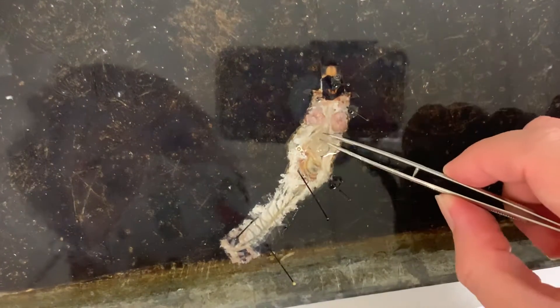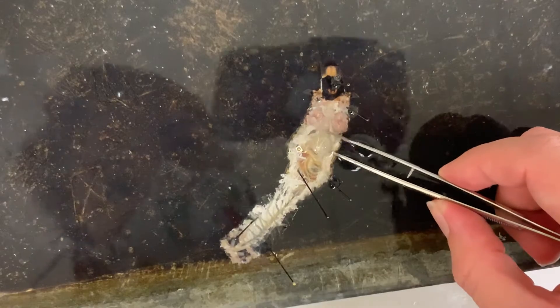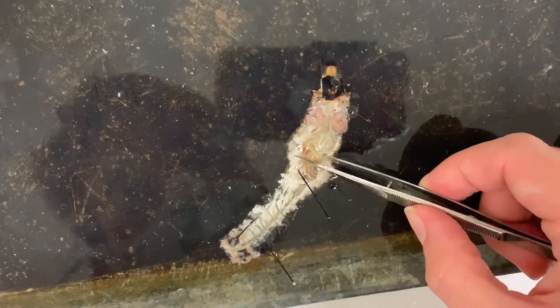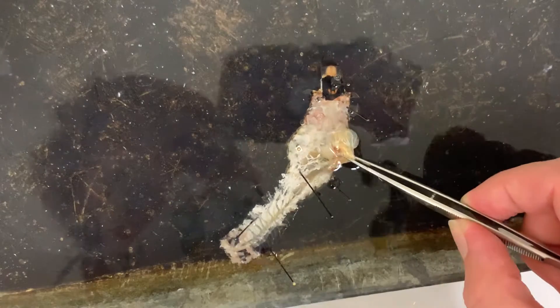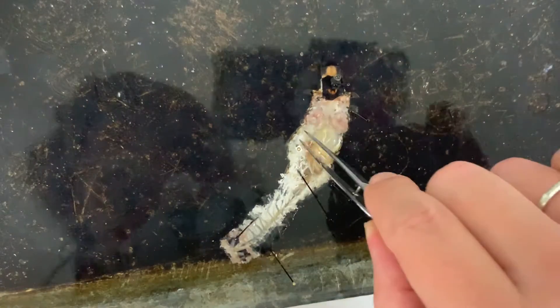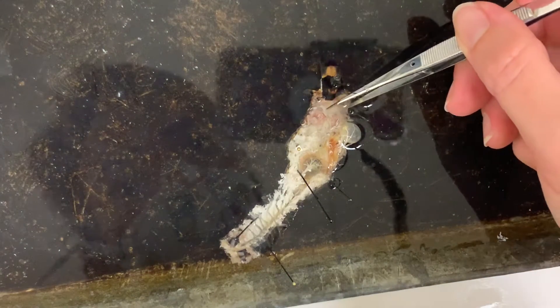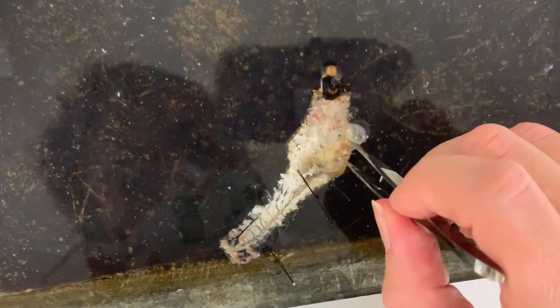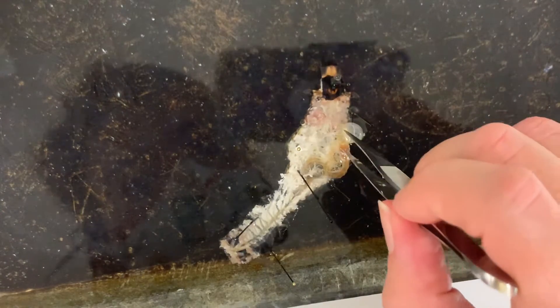Now let's focus in on the digestive system. It's right in the middle here and you can see it's got a little bit of air there. We've got the esophagus coming down into the crop, and it looks like the crop has got some hair in it.